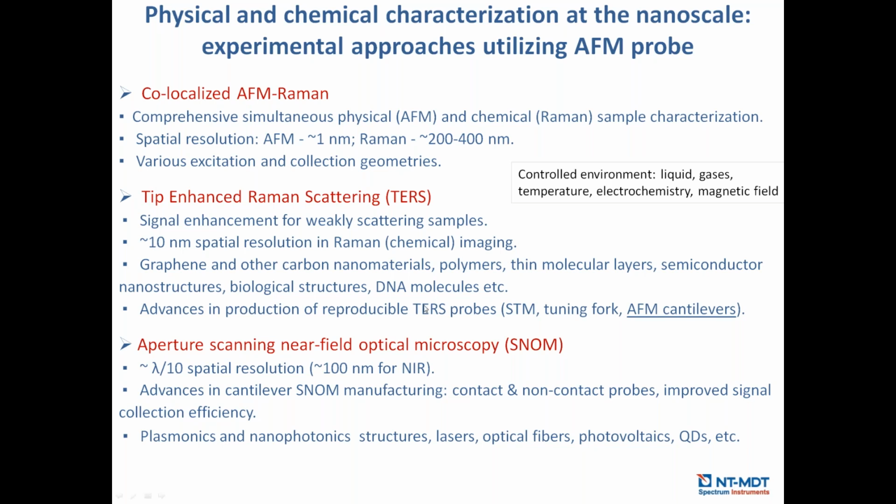Then we have discussed tip-enhanced Raman scattering, and the data which can be obtained with the NT-MDT instrument, with optical spatial resolution down to 10 nanometers.